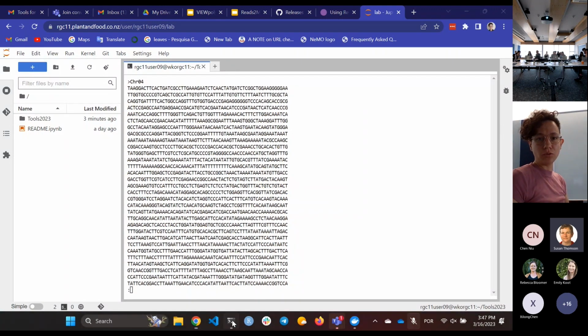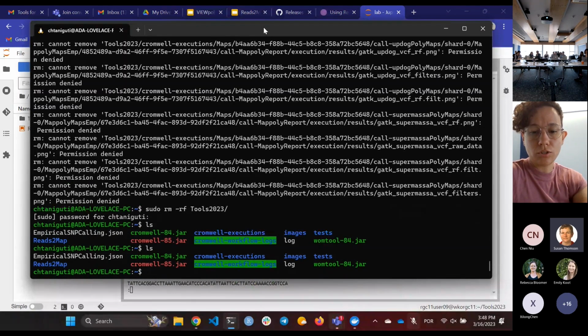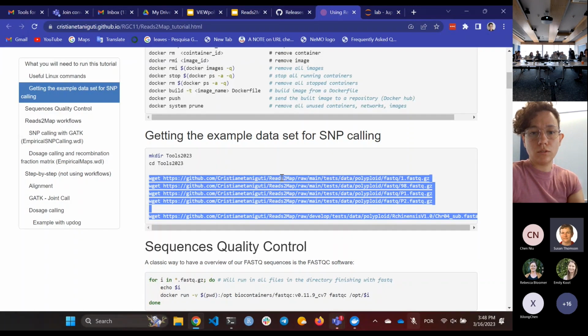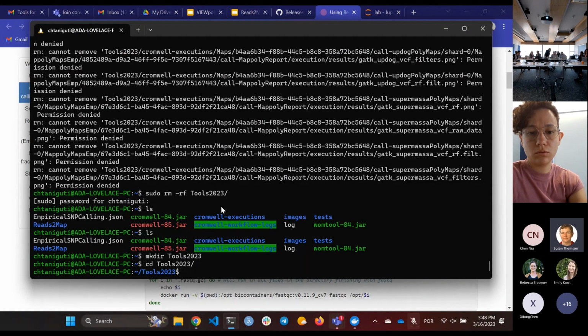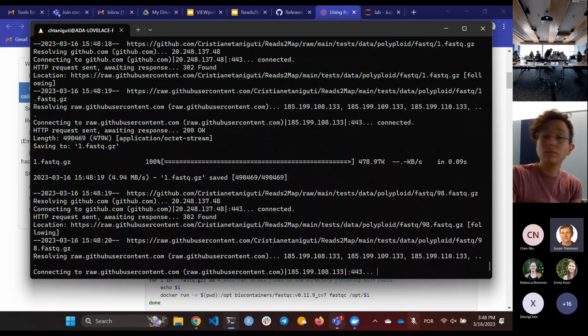So I'm changing here. I will do it in my terminal. Okay. File, and then just create a new file. File, new, and then you want a terminal. Okay, now we want to make a directory, so we just make folders. And then we want to just repeat them, this way. Now we've made the folders. Now we want to go into the folders.